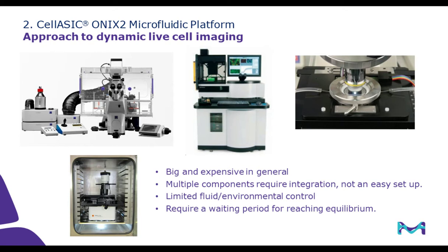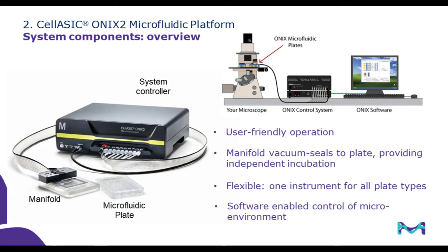For example, for a giant incubator like this, it takes 6 to 8 hours to reach equilibrium. After it reaches equilibrium, you would have to put the cells into the incubators by opening and closing the incubator doors. Fingers crossed that by opening and closing the door, the gas content would remain the same. And some live cell imaging systems allowed you to treat the cells during your experiments, but the tubing going in and out of the incubators is just too difficult to set up.